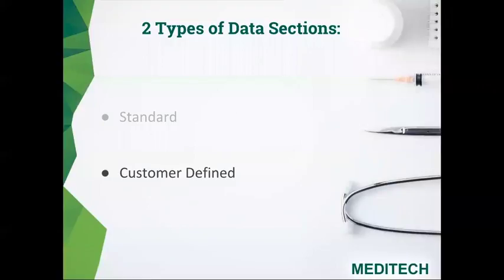We do have, last, another data section, which is the .wkld, which is for the workload. You would use that data section to assign workload to a specimen, and you can use this data section to account for additional work that has not been accounted for in other areas.